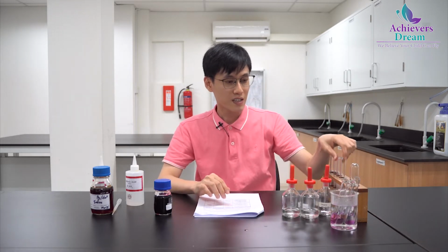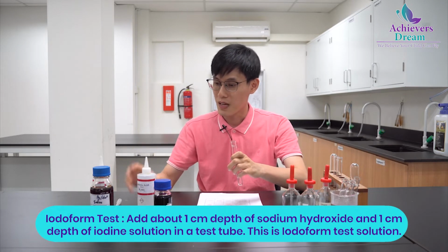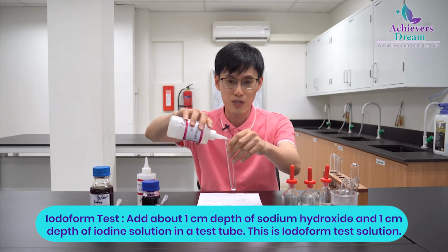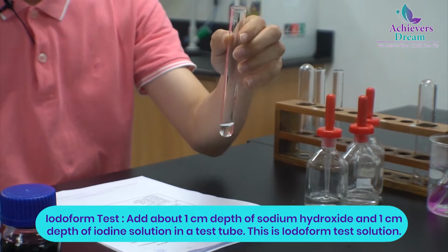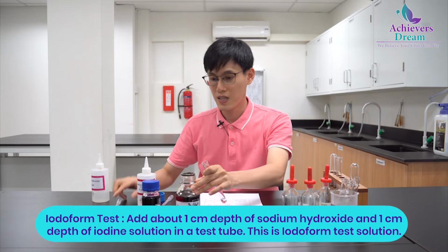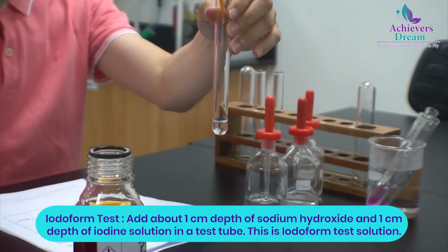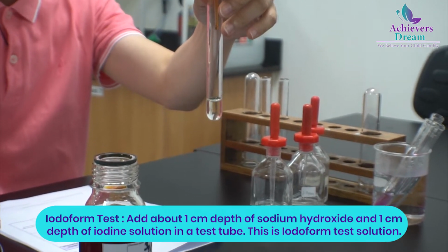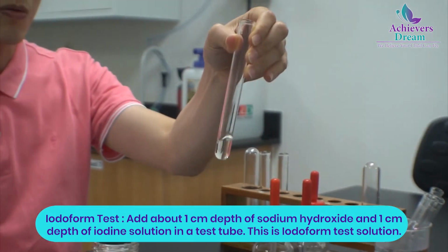So while waiting, let's perform the iodoform test. For the iodoform test, we'll be adding about 1 cm depth of sodium hydroxide to a test tube, followed by 1 cm depth of iodine solution. The iodine is decolorized because of a disproportionation reaction with sodium hydroxide. So this is normal, there's nothing to worry about.